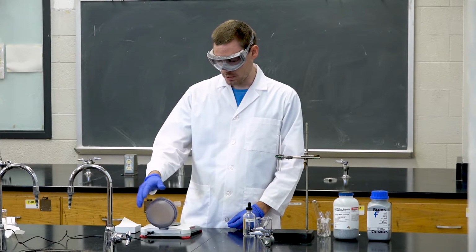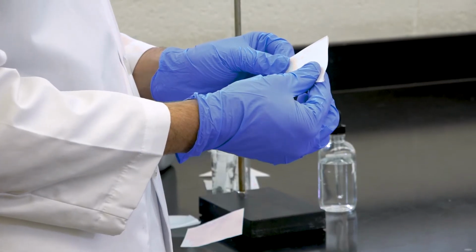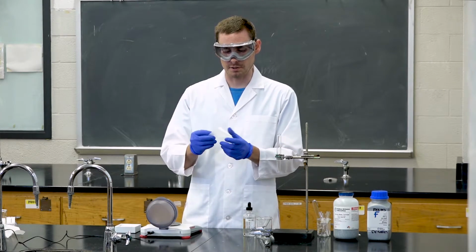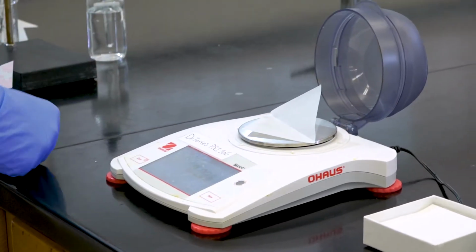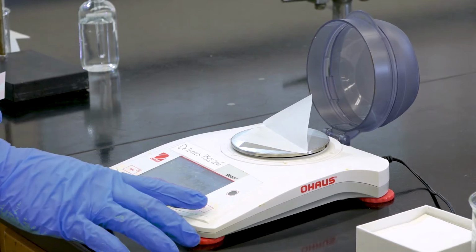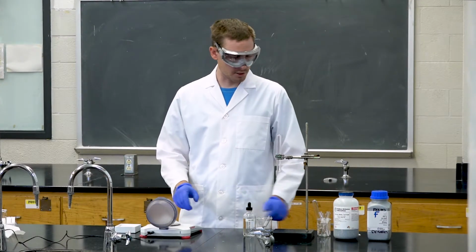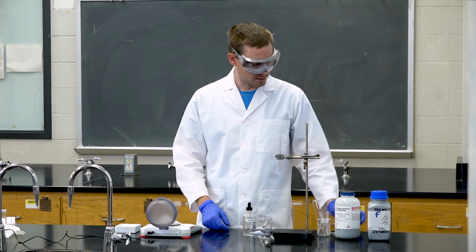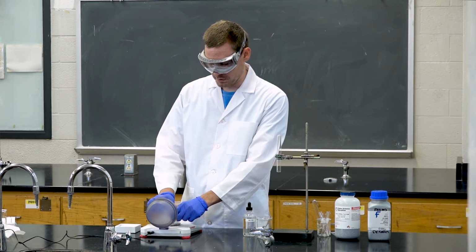small scale. So first, you want to crease a piece of weigh paper, like so, in half. This makes it easier to deposit the metal into a test tube after weighing it, and you can set it on the balance and then tare it once the numbers settle out or stop moving. Once the balance itself is at 0, you can then add, first beginning with zinc metal to the balance until you have 0.5 grams.